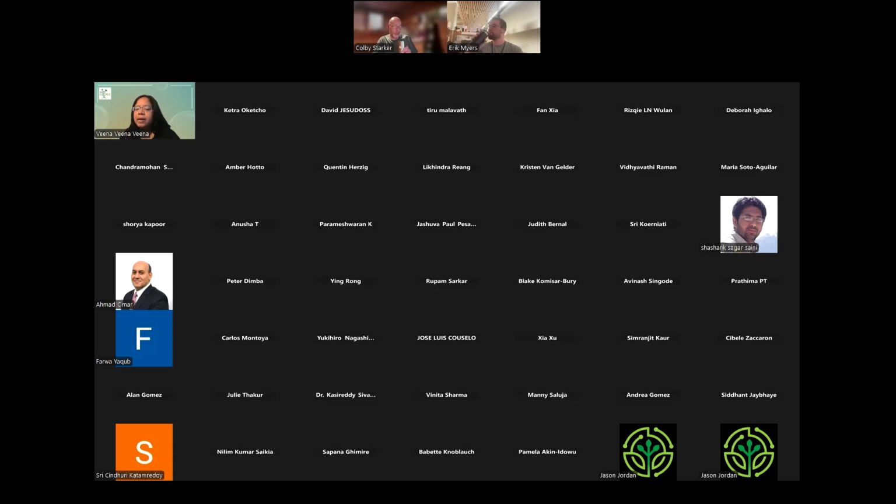Thank you. There is a question from Likindra. The question is how to design polycistronic tRNA-gRNA guide RNAs for multiple target editing in plants with a single construct.